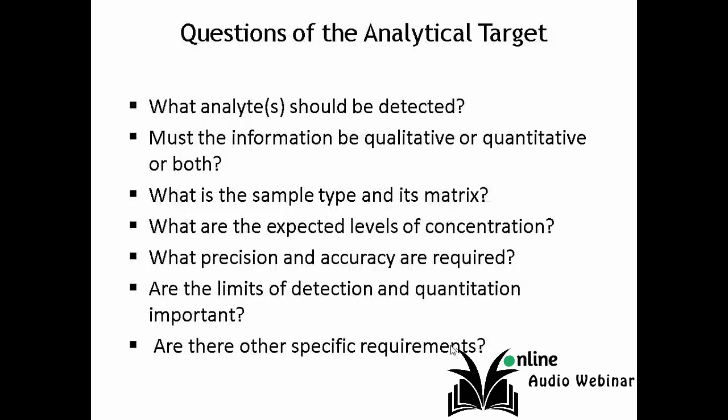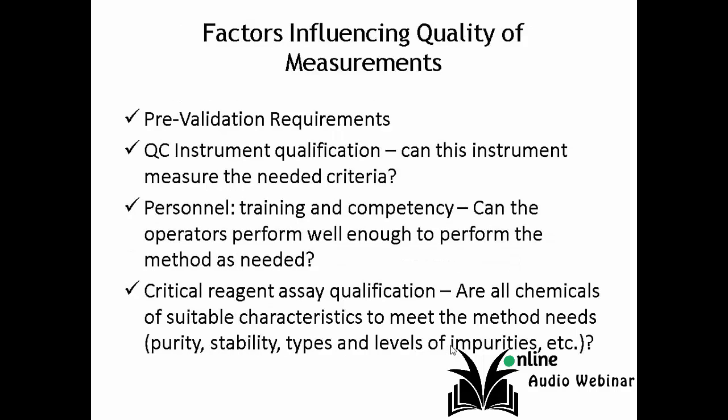What analytes are you going to determine? Many of the things that come into place are defined in here. If you already have a prescribed instrument that you're going to use, then that is a framework or a limitation on what you can do as far as methodology and its capabilities.